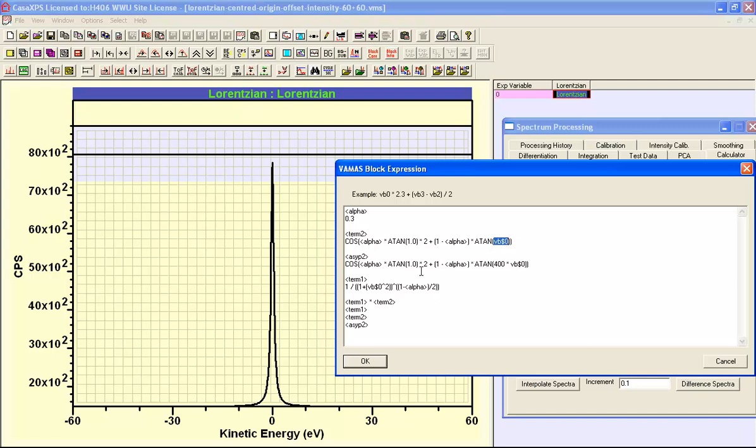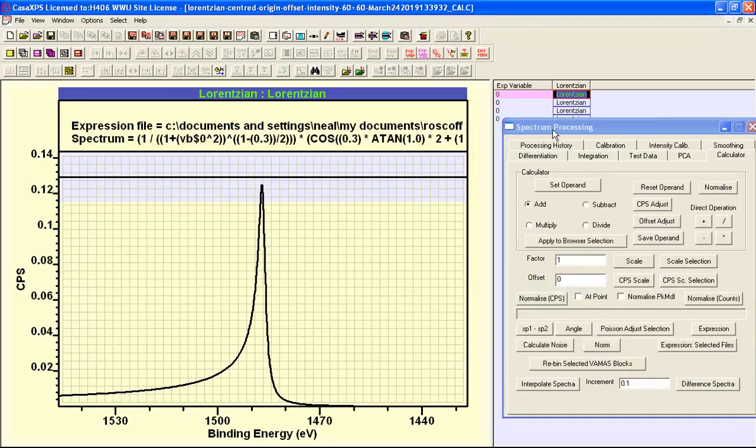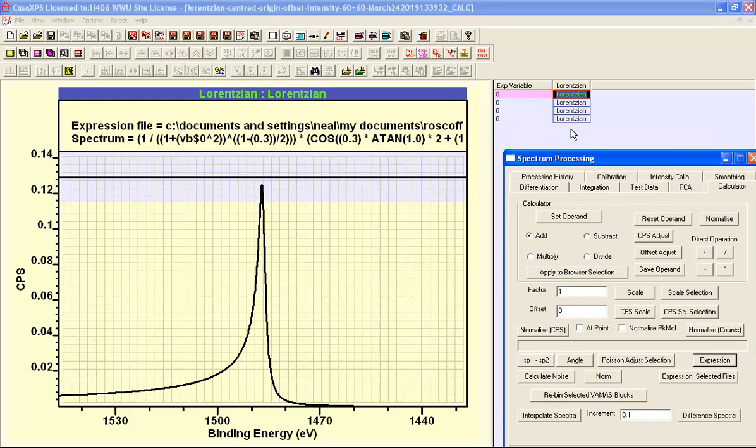This is going to use the calculator as if it's simply creating these functional forms based on the energy range here. So these new spectra will be constructed by taking these forms after the substitutions have occurred for whatever is in these angle brackets. After pressing the OK button, the calculation is performed, and the first one was the product.